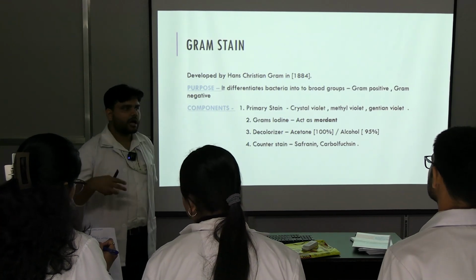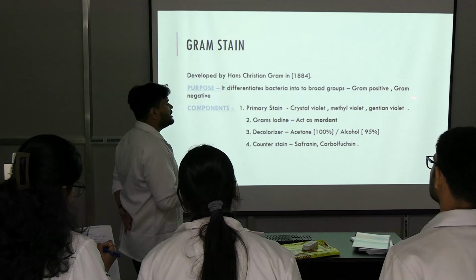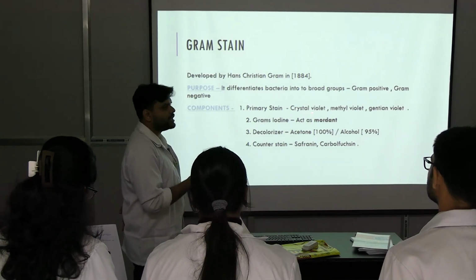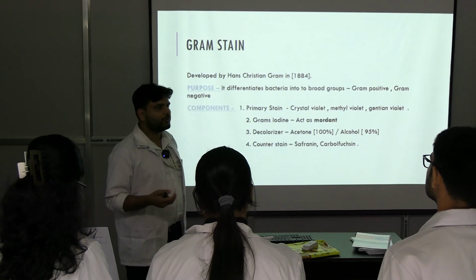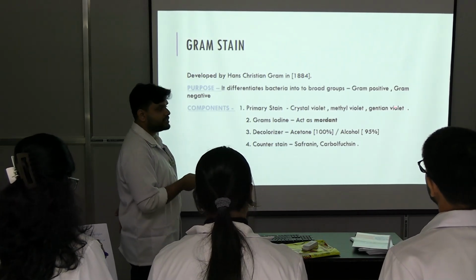Okay, if you are answering very well now, they will ask you some honors level questions. The basic question is, what are the primary stains? So you can definitely answer this. The honors level question will be, can anyone tell me the difference between crystal violet, methyl violet and gentian violet?